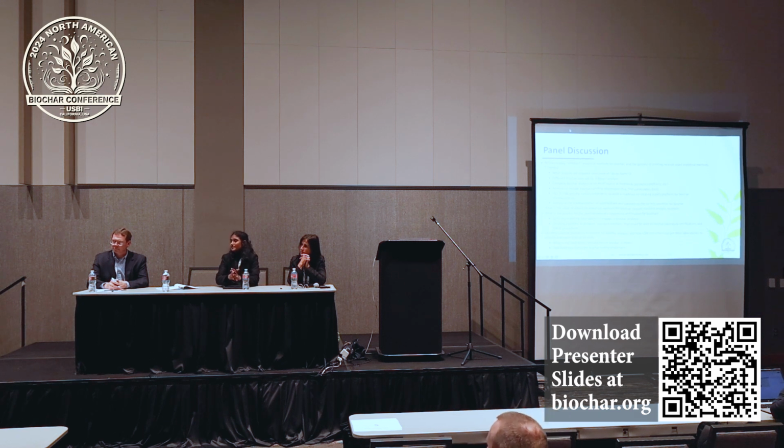Then if you pick it up, it should be pretty easy to crush. I mean, a big piece might be hard, but you should be able to crush it. It should be friable. And it shouldn't leave a greasy feeling on your hand. It'll be dusty, but it should never feel greasy. And then when you smell it, you might smell a tiny amount of barbecue if you get it really, really close. But if you open a box of it and suddenly you're like Texas barbecue pit, you got a problem with volatiles.